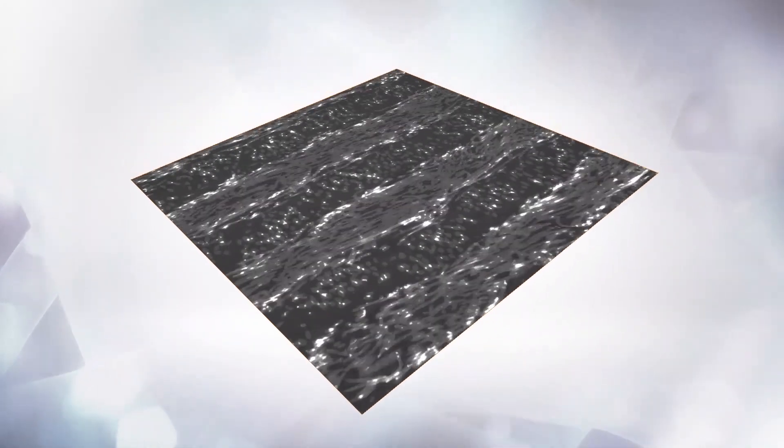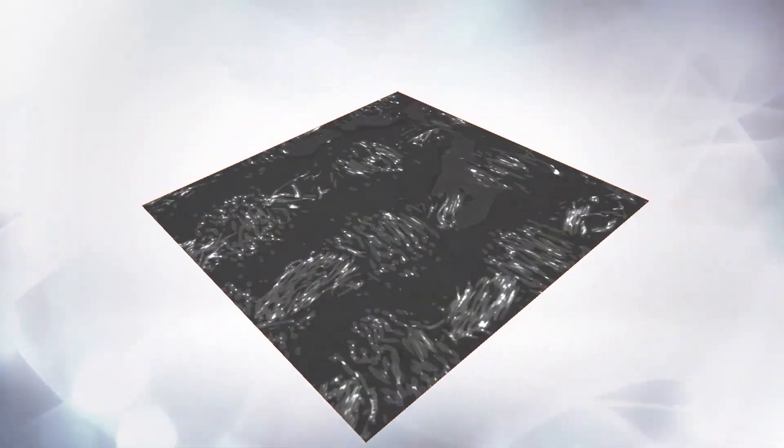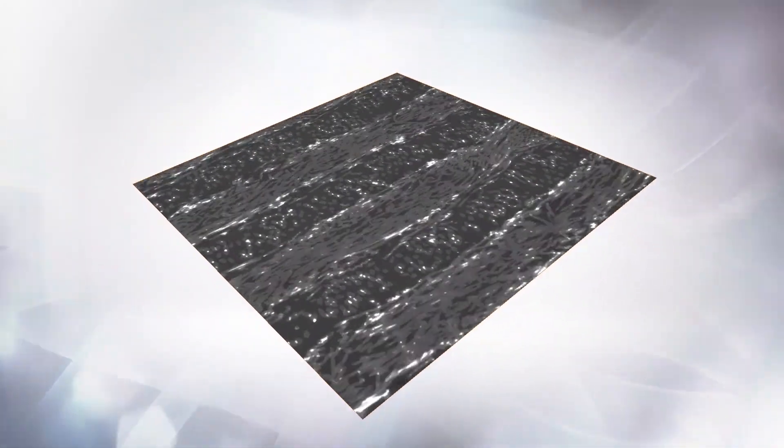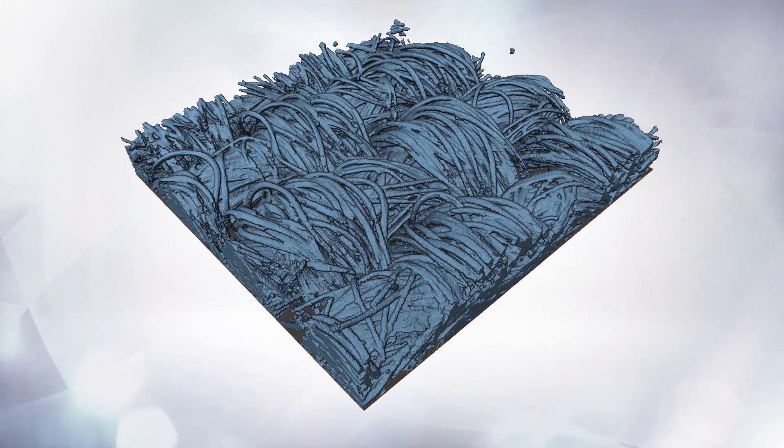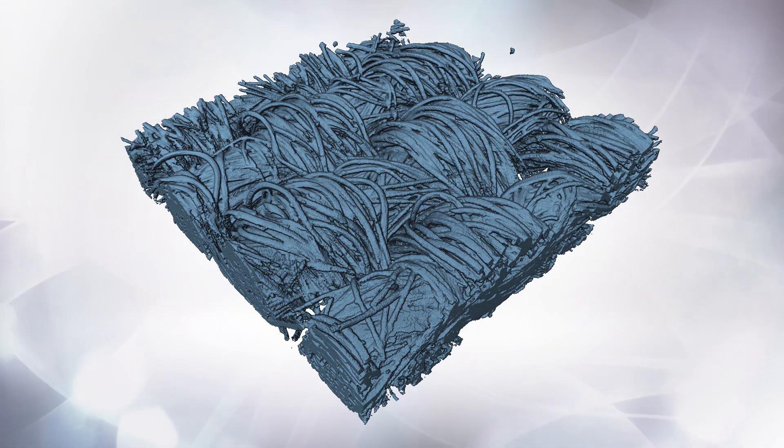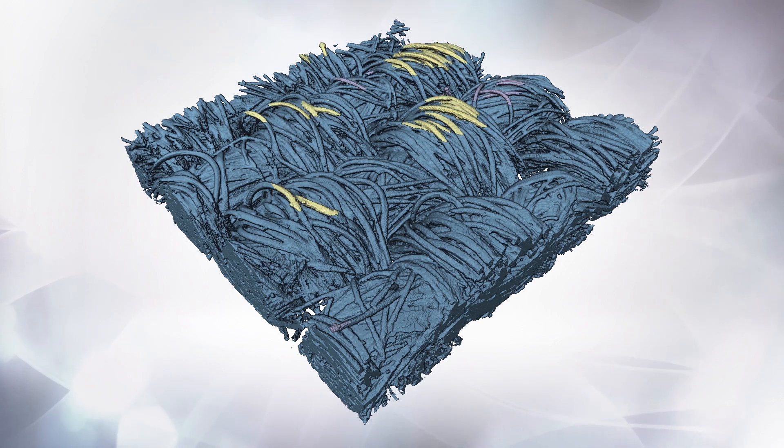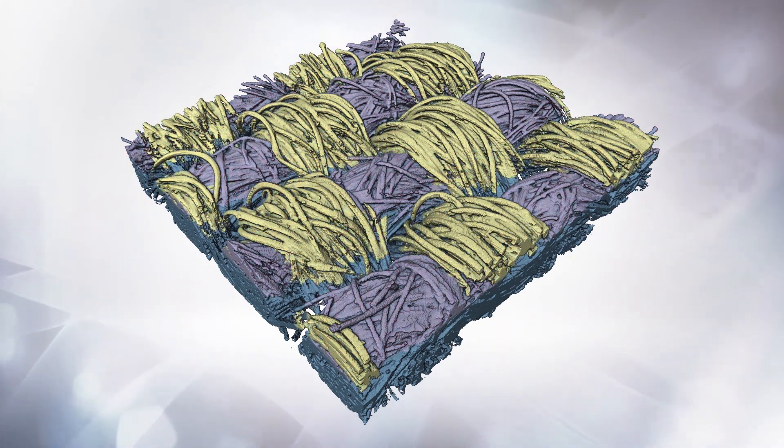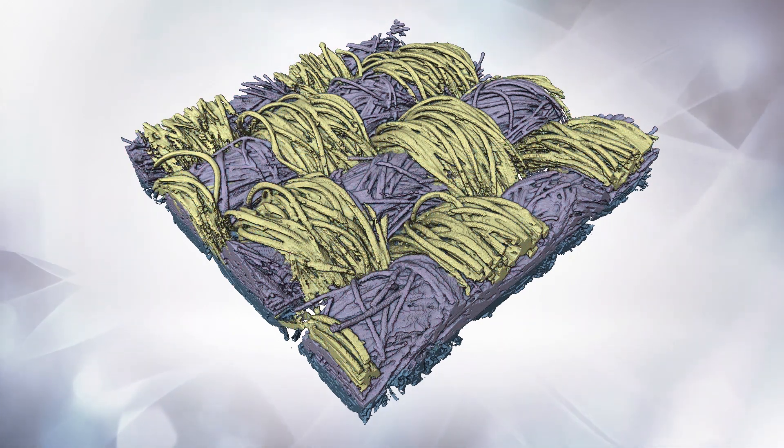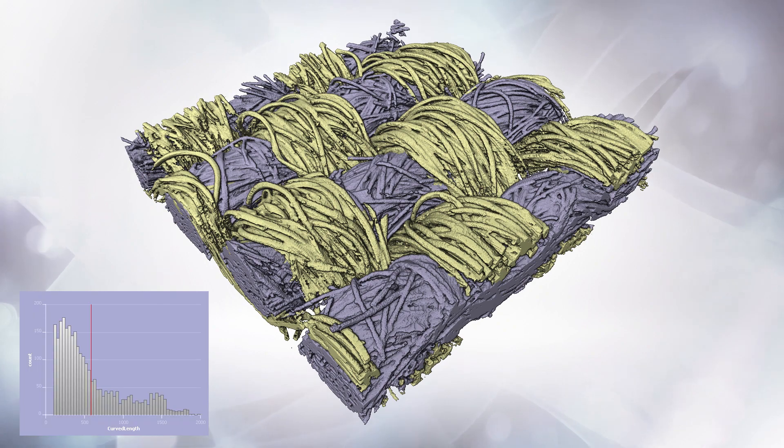However, Aviso offers a lot of different applications within the package. So some of the freeware you can get great visuals, you can get really nice volume renderings of your data. Some are very good at analysis and some are good at quantification.